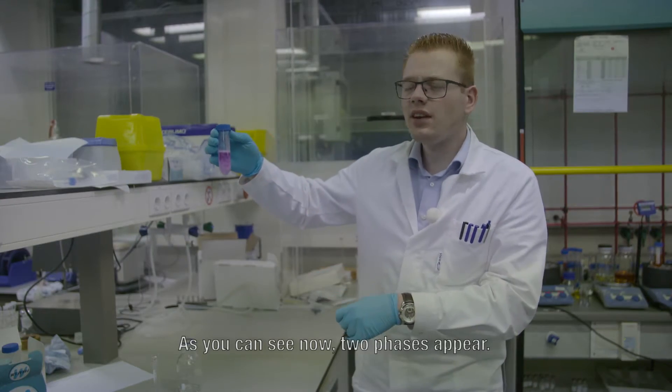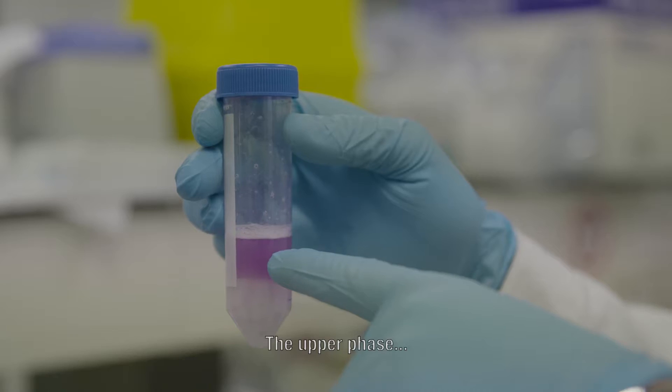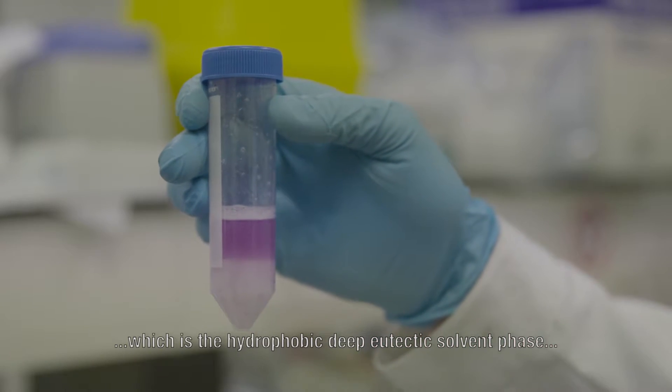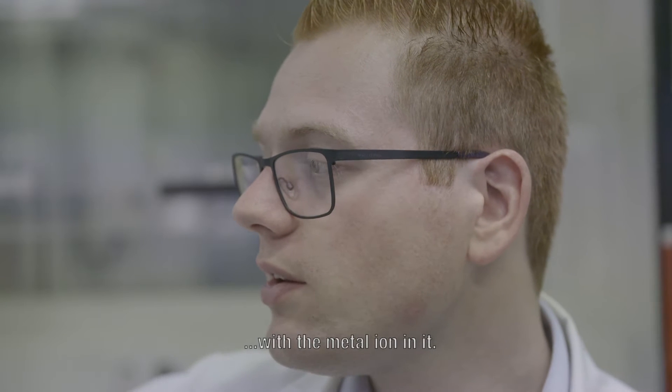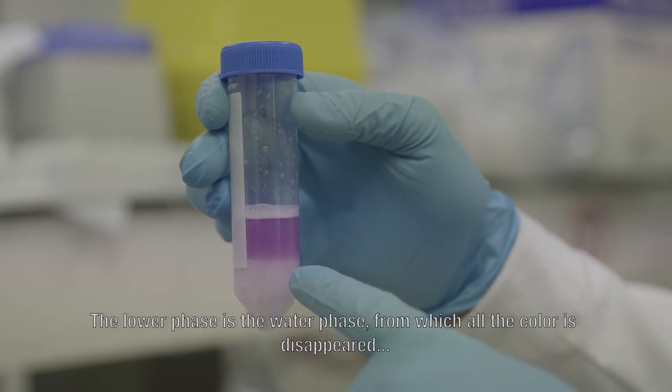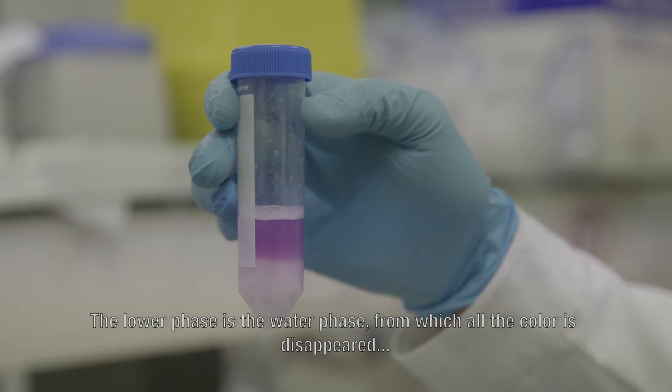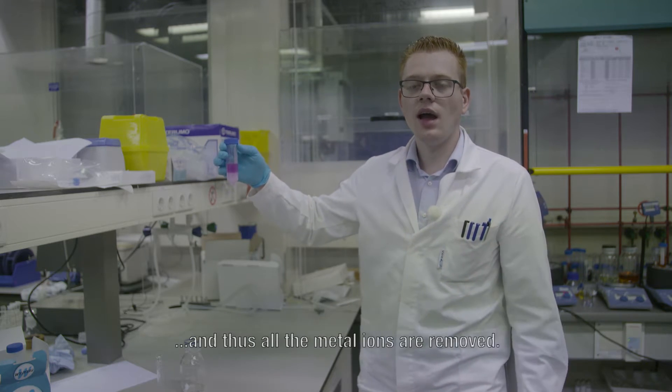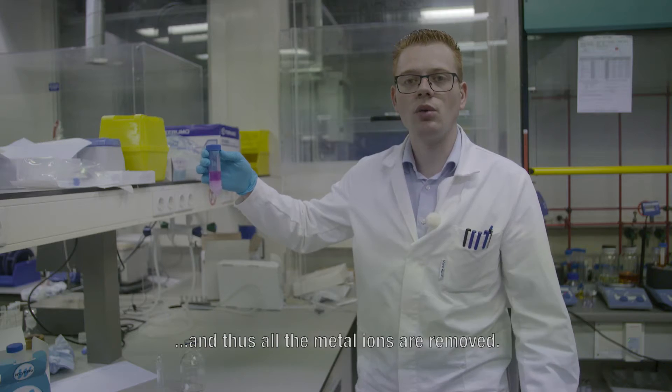As you can see, two phases now appear. The upper phase is the hydrophobic deep eutectic solvent phase with the metal ion in it. The lower phase is the water phase from which all the color has disappeared, and thus all the metal ions are removed.